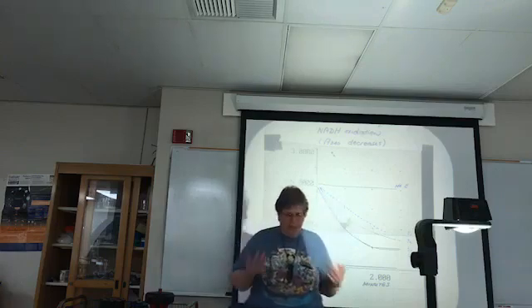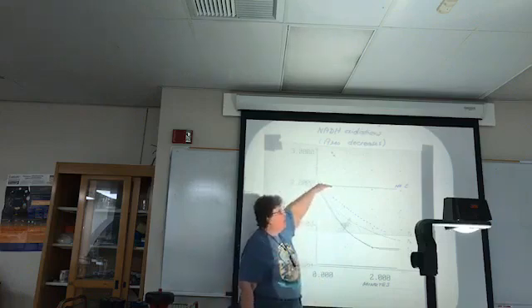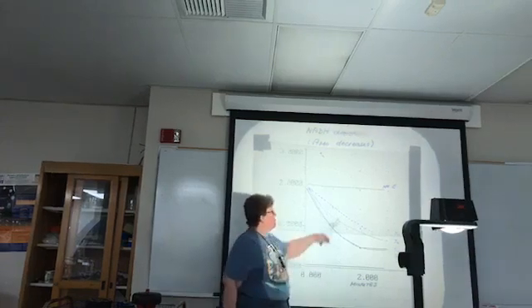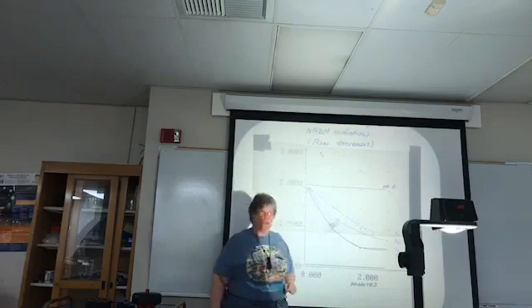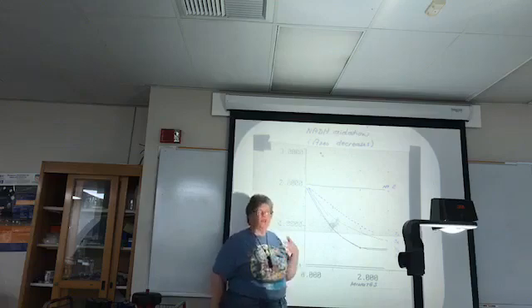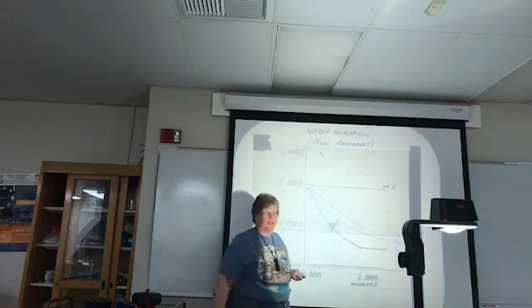Then in part B, you're going to be measuring by using greater and greater amounts of enzyme. And if you did not have any enzyme at all in there, the reaction would not take place. But as you add more and more enzyme, if you add then 4 microliters of enzyme, or 5 microliters of enzyme, or 6 microliters of enzyme, the rate's going to increase. And it's going to increase because you now have more enzyme in your reaction. So you have that same catalytic rate, but by increasing the concentration of the enzyme, you now have the ability to make the reaction go faster.